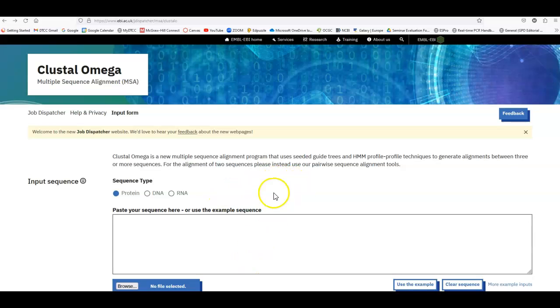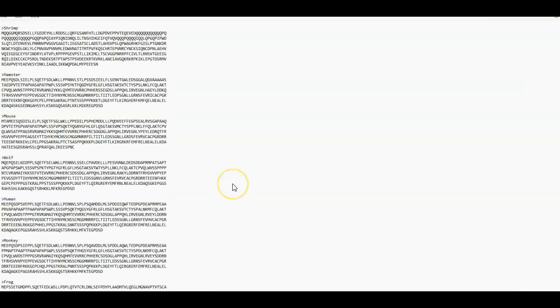So the first thing you have to do is get a bunch of sequences, and I have some here. This is just using Notepad with a whole bunch of sequences for the P53 tumor suppressor protein in different organisms. Now, I shortened the names of these. Obviously, there's different kinds of shrimp and different kinds of hamsters, but just so the alignment's easier to read, and you'll see why. So these are protein sequences. You'll notice that they all start with M for methionine.